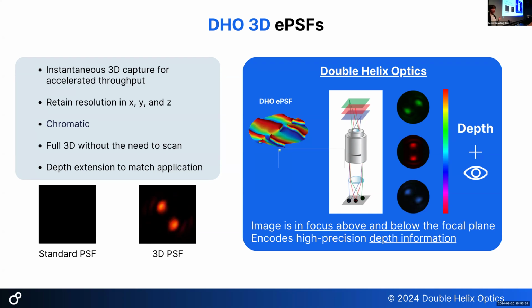So you're able to ground truth the optical imaging system, but not so much the added components. And once you have machine learning, then you're building in additional assumptions about what the structure of the 3D world is, right? Well, except we know the shape, so we're not really making assumptions about the structure, because we know the shape of the PSF is this. We know it's two lobes, right? Or it's that single lobe, or it's our squiggly. So we know the shape. So when we go searching, we know that we're looking for two spots, for example. Okay, thank you. Does that make sense?